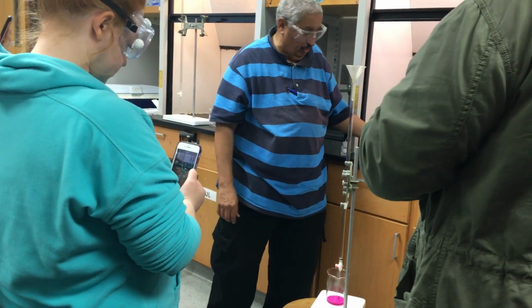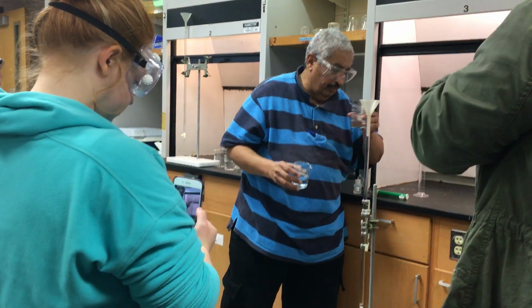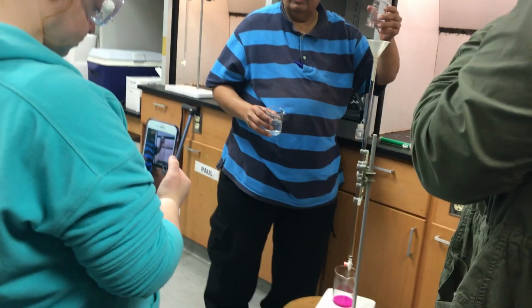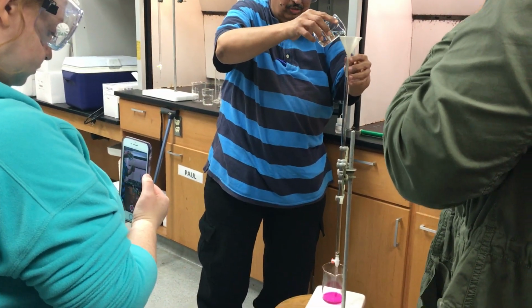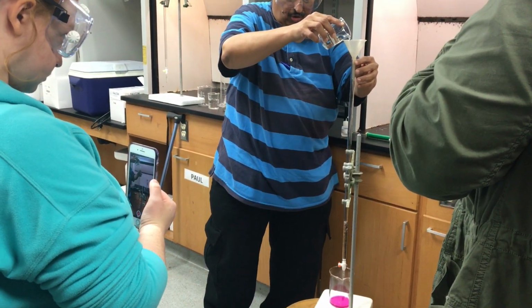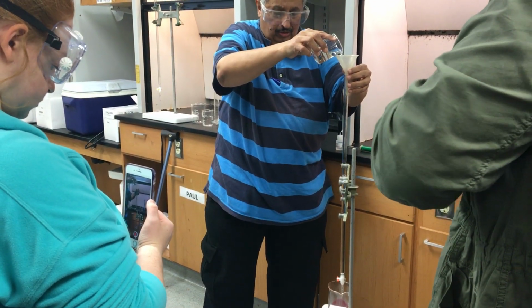So I'll put my sodium hydroxide here. I'll try to put it, let me see here. That's vinegar. You can smell it, correct? You can smell it. So I put this one all the way to 0. Now it might go above 0, but I will just adjust it to be on 0.